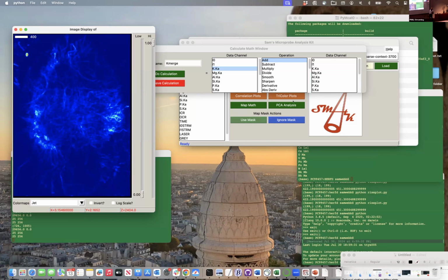And it rounds it up to the nearest 100 or tens that makes sense. It tries to only give one significant digit. So you're not going to find a scale bar of like 405 microns. It'll round up or down. And it'll do the closest thing to 10%. I have not made it flexible, so you couldn't just say I want to see a 1 micron scale bar on this data. But it's an option that we could support if you wanted to set a precise value.